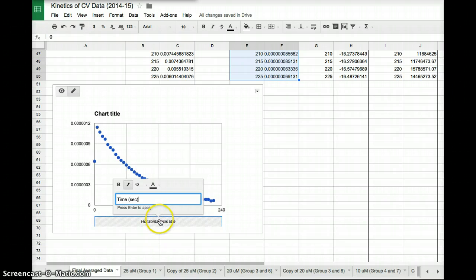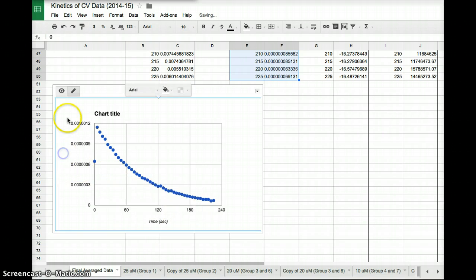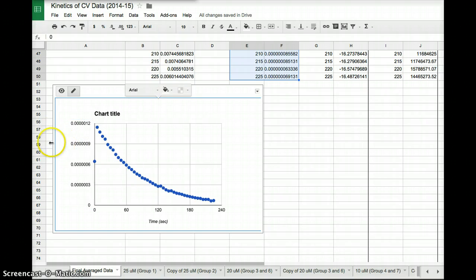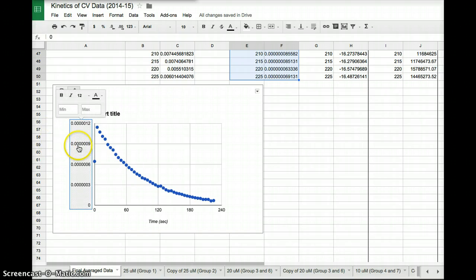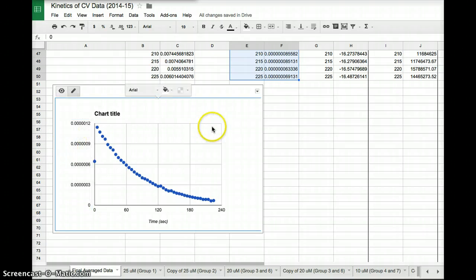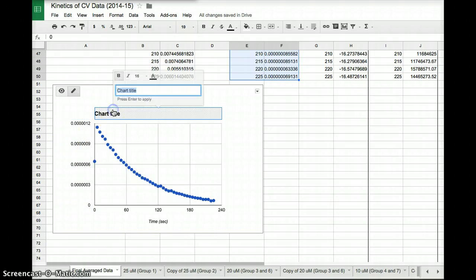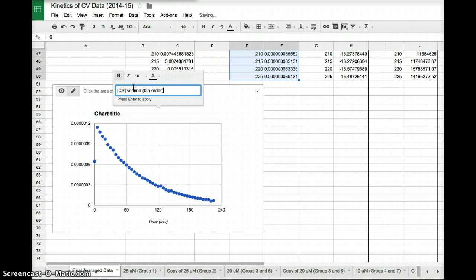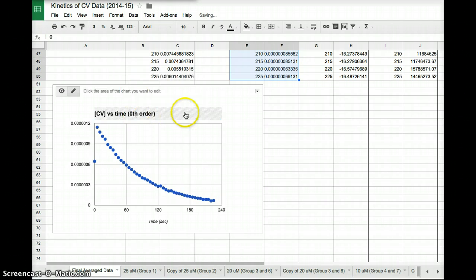On the X axis down here, I can label that. This is time in seconds. I just click on it here to type in that. And then on the Y axis, I can click on the Y axis to edit the values, but I can't edit the name. So if I want to edit the name, oh, it didn't save this here. So make sure you hit enter to save it. I want concentration versus time, zeroth order. Boom.